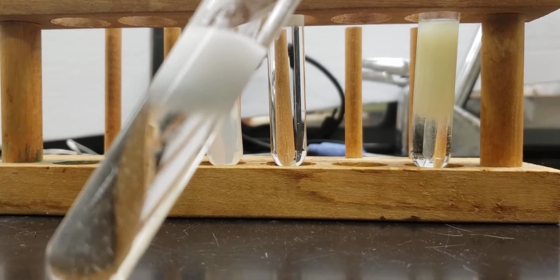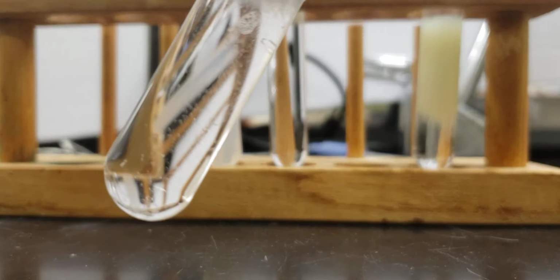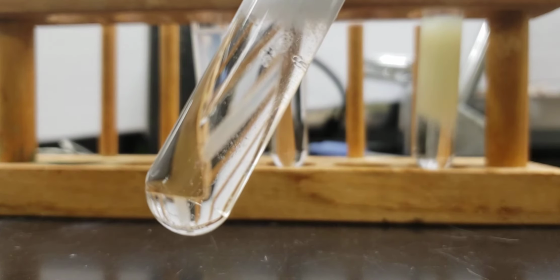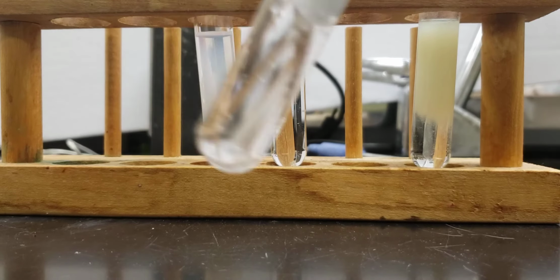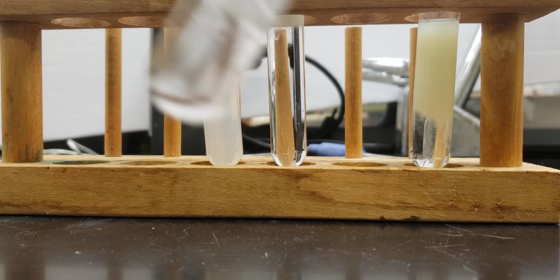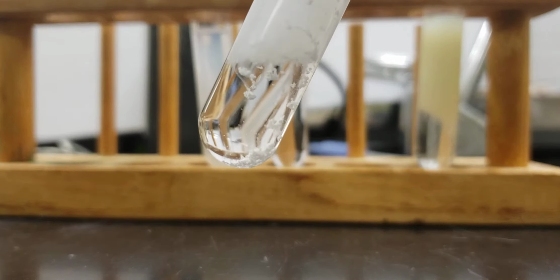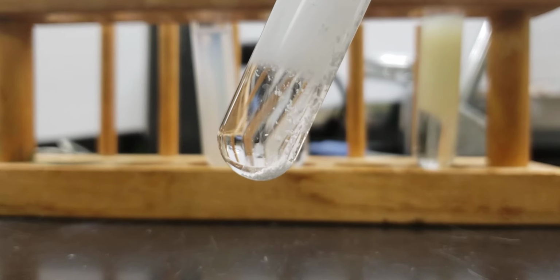This one right here ends up being a very bright white, silvery color, and if it focuses, you can see some of that white, silvery solid coming in at the bottom. We'll give this one a shake as well. You see that it's precipitating out rather nicely.